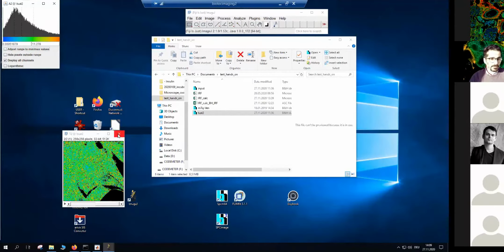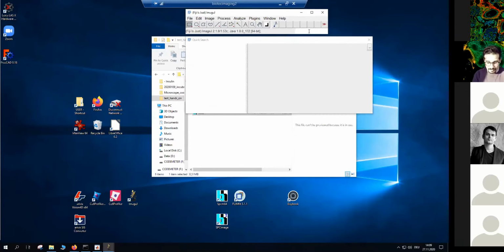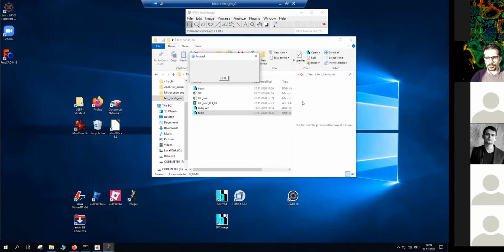And we go now to FLIM-J, which is the new generation of SLIM curve. I think I can call it like that. For that, just go to FLIM-J by searching for it. It is under Analyze, Lifetime, FLIM-J. Just run it, and ta-da, there is the first point regarding FLIM-J in comparison to SLIM curve: you need to open your data first in Fiji and then run the plugin. It would be amazing if it were like SLIM curve, where when you run it, it asks you which data you want to analyze. Soon we will see what the problem with that is.